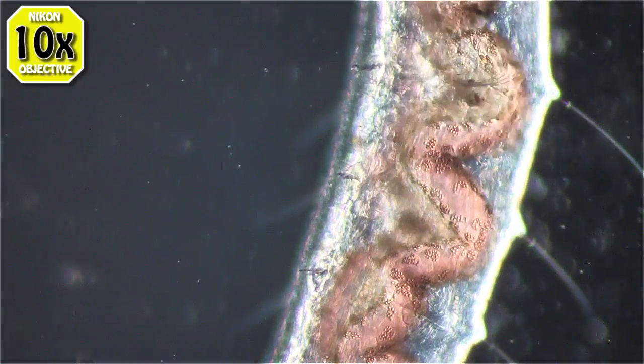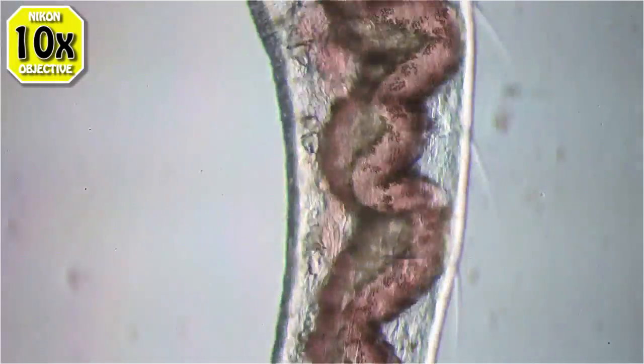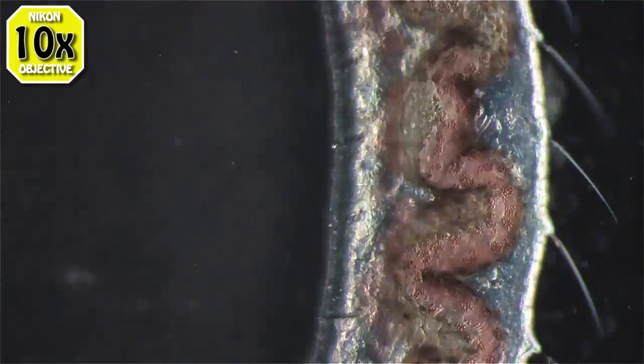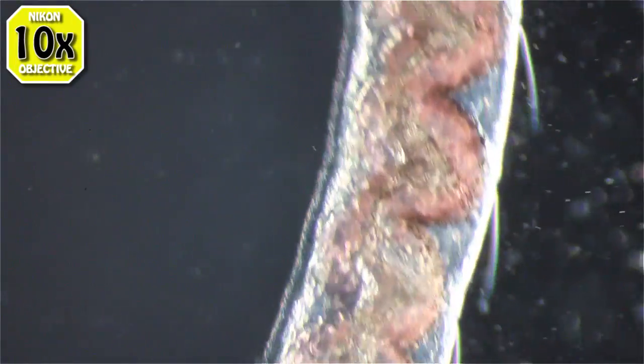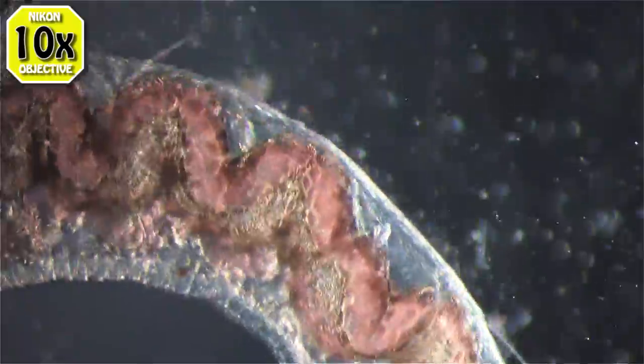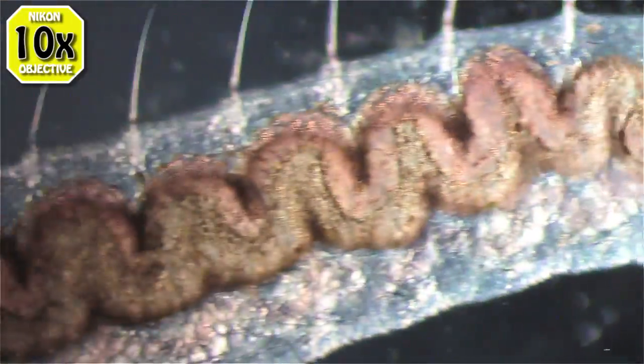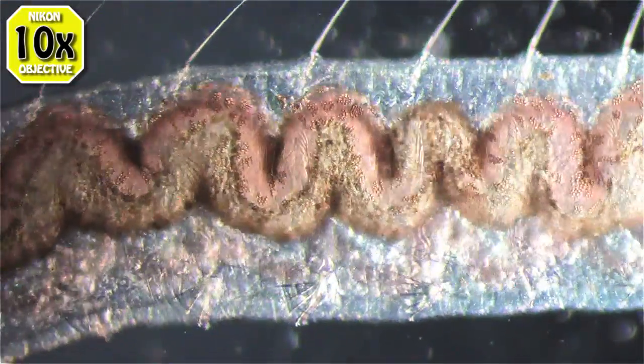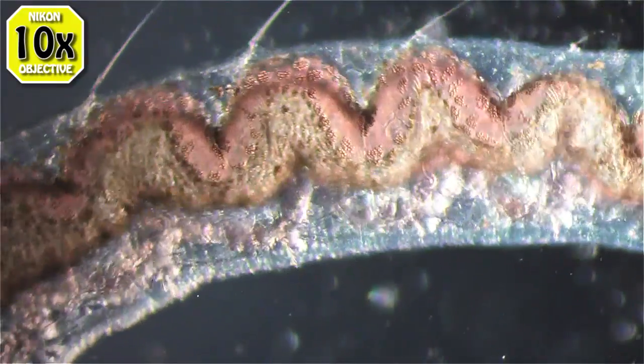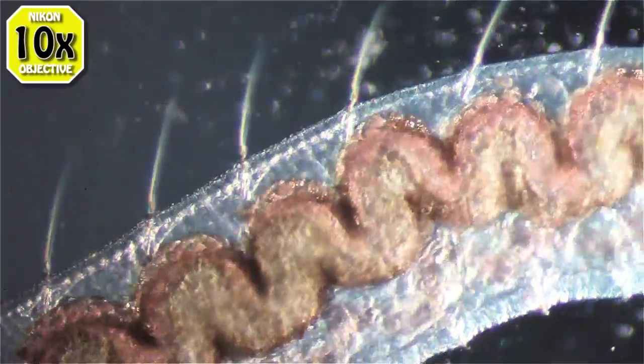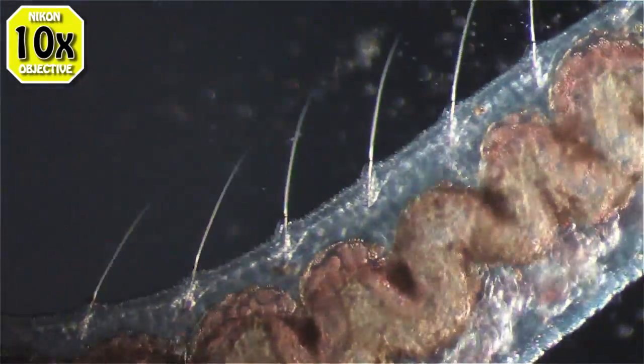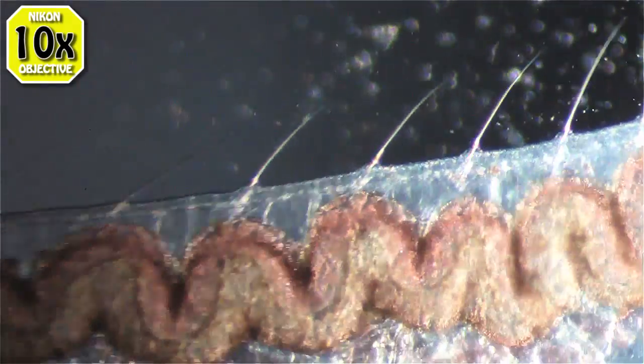If it's in the bright field position and you offset it a little bit, you get nice oblique lighting and if you go a little further you get dark field. I've never been a big fan of dark field, but this works pretty good.